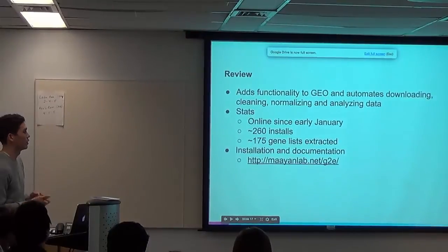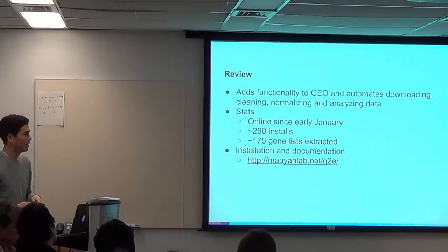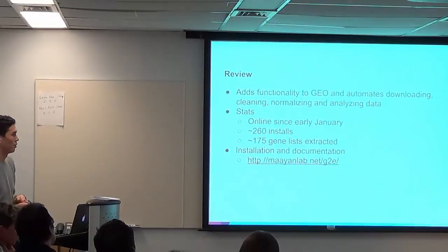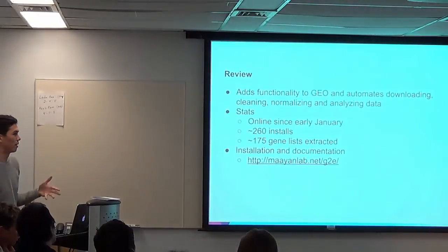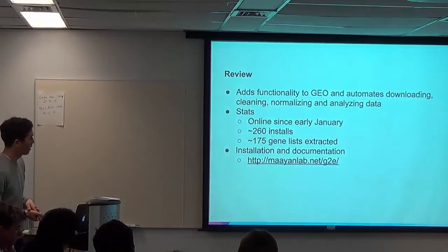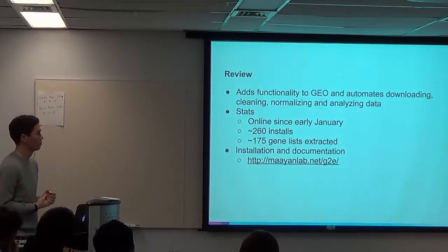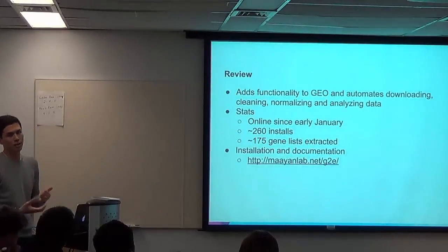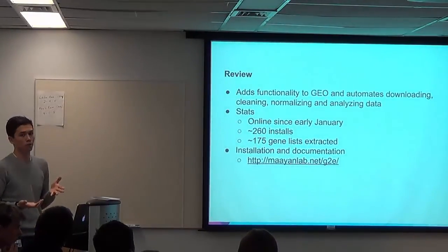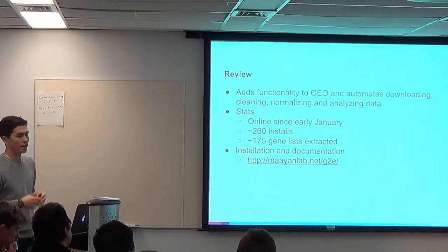To review, it just adds functionality to Geo and automates a lot of these things. I'm a software developer, so if I do something twice, I think about automating it, and if I do something 3 times, I want to automate it. So hopefully, if a lot of people are doing this around the research institutions, this will help simplify that process. Really the idea is to lower the barrier to entry for researchers who have less computational expertise or simply don't have the time, and also to allow them to come up with novel hypotheses more quickly by making this seamless.